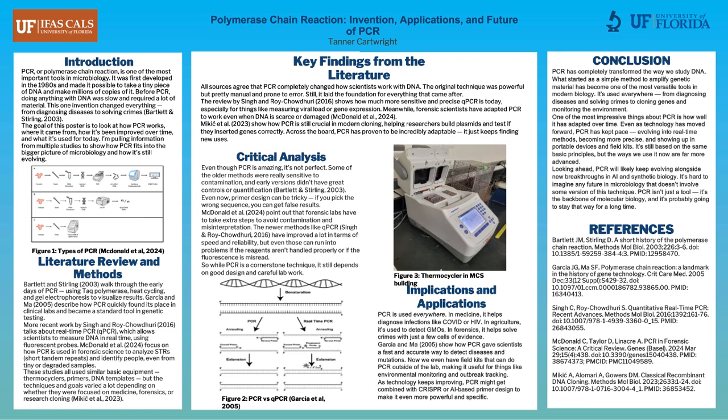So here in Figure 1, we have a couple of different types of PCR. The top one, I believe, would be traditional PCR. The middle one is qPCR, or real-time PCR, and the bottom one is the modern, advanced method of PCR. There are much fewer steps in certain laboratories. They've made it very simple over the years, which I'll talk about.